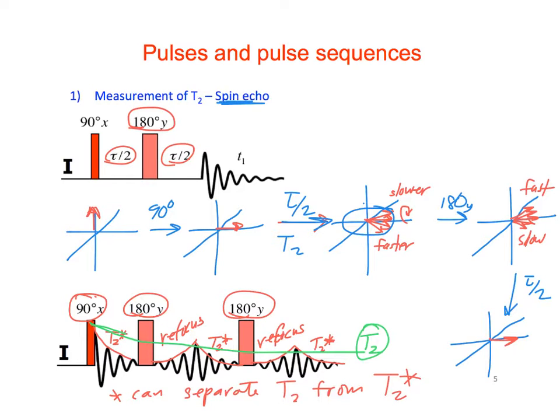All right? Yeah, because how would you discern T1 from T2 in a plot like that? Well, I guess the length of this experiment here could never be longer than T1, right? Because T1 is taking place at the same time, and once it's relaxed by T1, there's no more signal to dephase. So I guess, yeah, this amount of time's got to be short on the order of T1 at least.